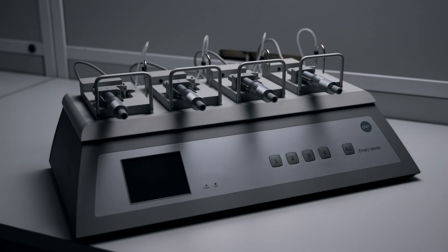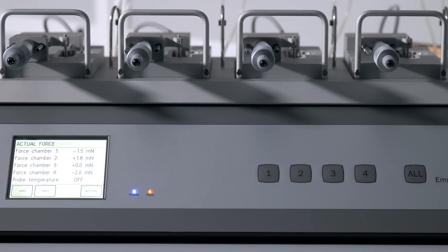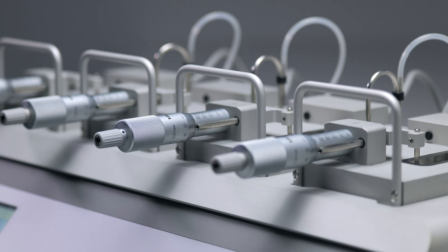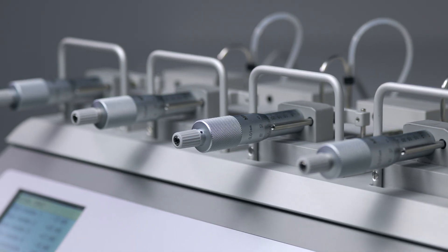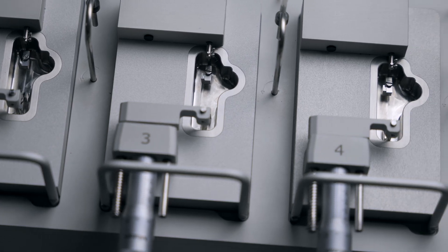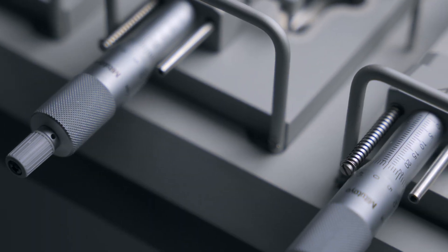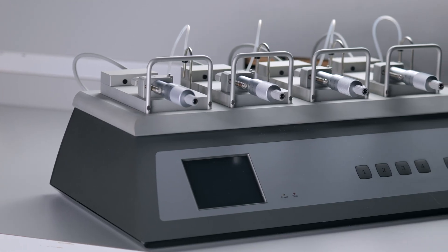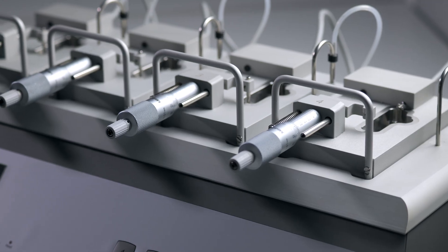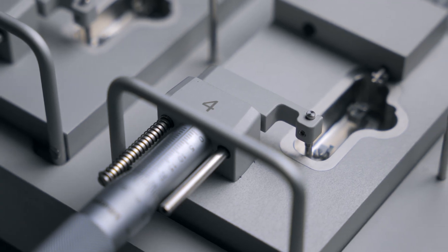The 820MO is a compact, reliable, and consistent organ bath system. It has been redesigned with updated features and capabilities from an existing system. You can easily swap mounts for either rings or muscle strips, or even have them side by side. The micrometer allows for smooth and accurate tissue adjustments. The small footprint is significantly less than your traditional organ bath, and the durability stands up to daily use and provides consistent results between experiments.